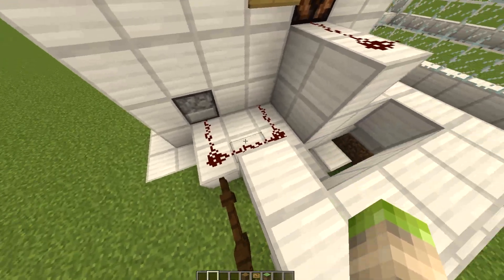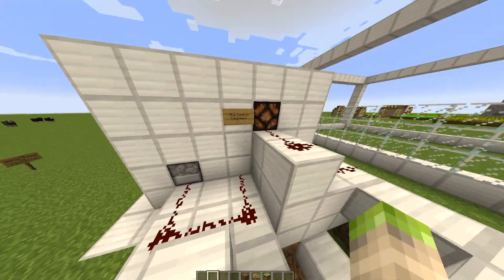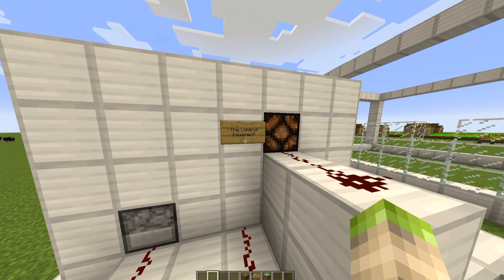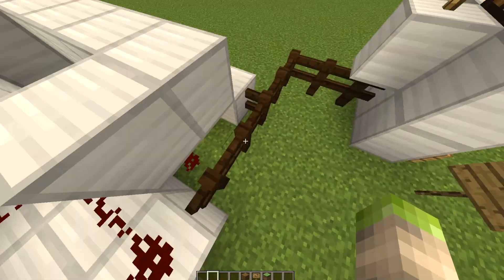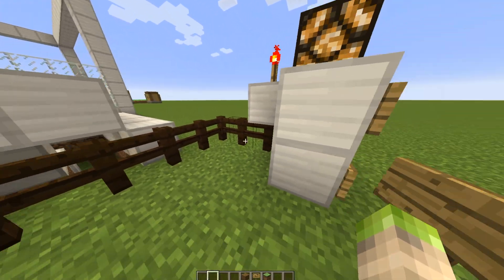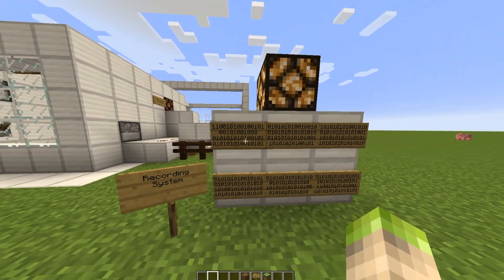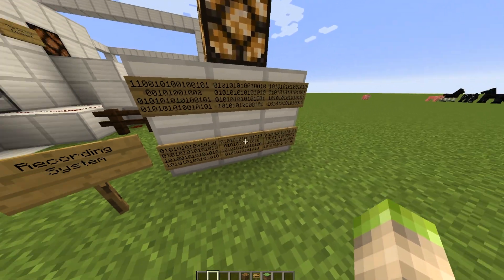Alright, this is the outside of our operant chamber. Since Robbie's so smart, he developed all of this — look at all these complex wires and patterns. This is the control equipment. As you can see, everything's controlled by this equipment. We connect these wires, and all the data from the dispenser is fed into here — the recording system. All this binary data.